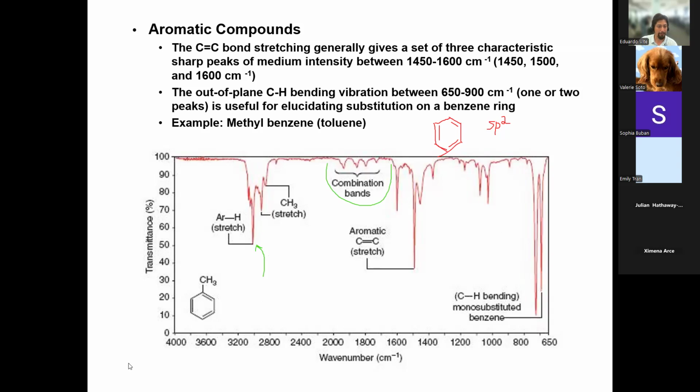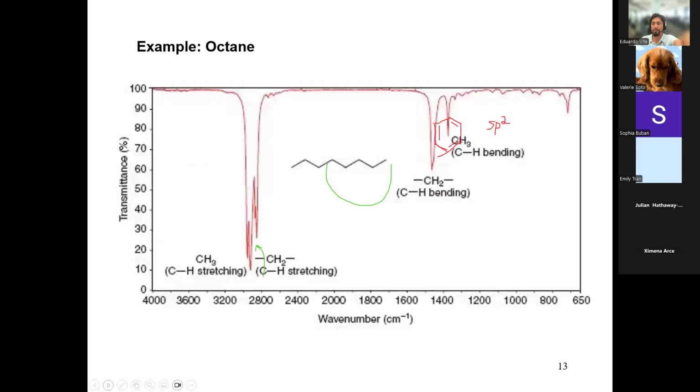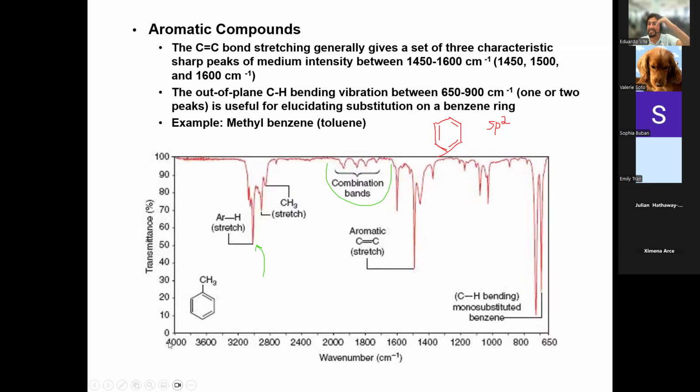And also, notice how the peaks at 3000 that we expect every single time, notice how their intensity has changed. If we go back to the previous example, you'll see that they are very intense. They go almost to the bottom, to the x-axis. But notice here, the intensity has been reduced. Now they are medium sharp peaks because again, it takes a lot more energy to vibrate them, and therefore the dipole doesn't change that much, and that's why you see a reduced intensity, right?